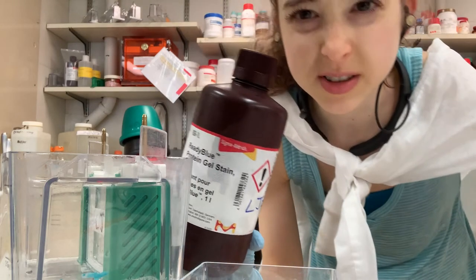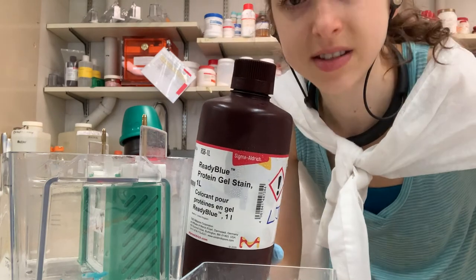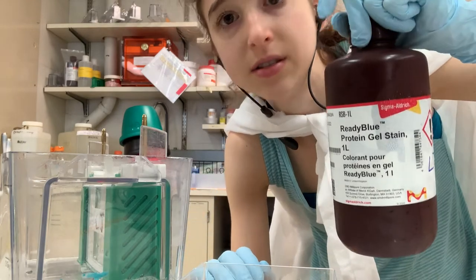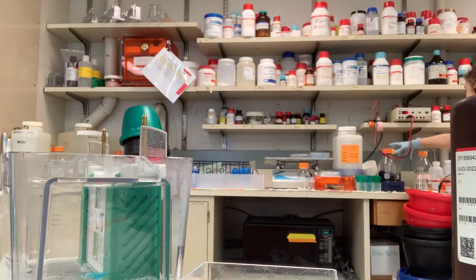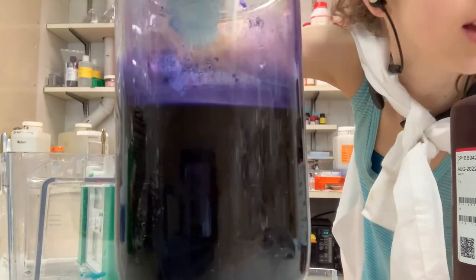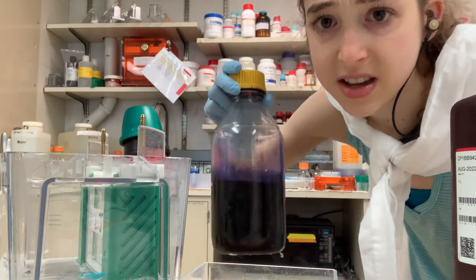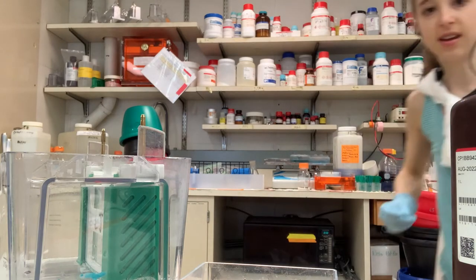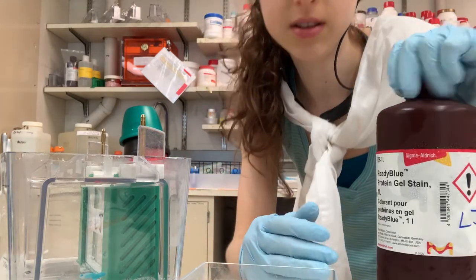This is an Instant Blue stain — we've been trying out a bunch of different ones because the one we used to get got discontinued. It's based on Coomassie, which is the classical stain. Classical Coomassie is this super dark stain that stains really nicely, but you have to de-stain and fix it. Instant stains are really nice because you can see things with less background, and you can reuse the stain many times by storing it in the fridge.